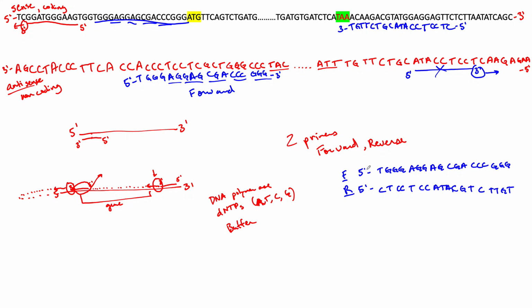Now before I send them off to the company to order them, I'm going to put their sequences into a primer checker, basically an online tool that will check the primers. And some of the things that I want to check for are melting temperature, which is abbreviated TM, hairpin loop formation, and primer dimer. And I wrote delta G here. Let me explain what this means.